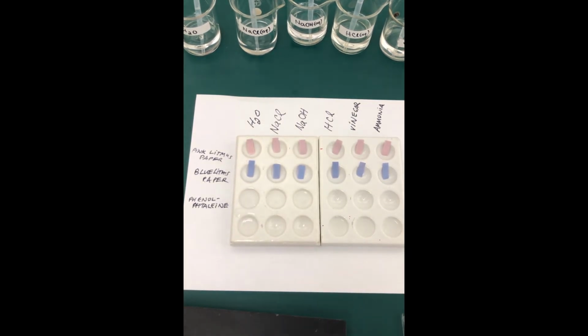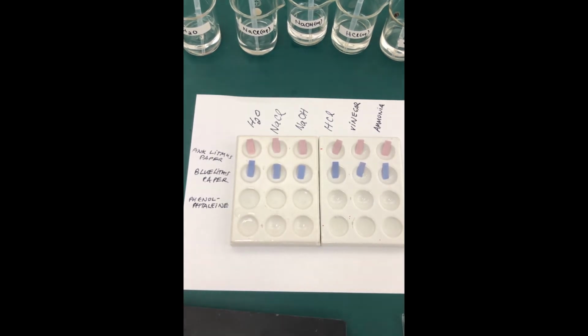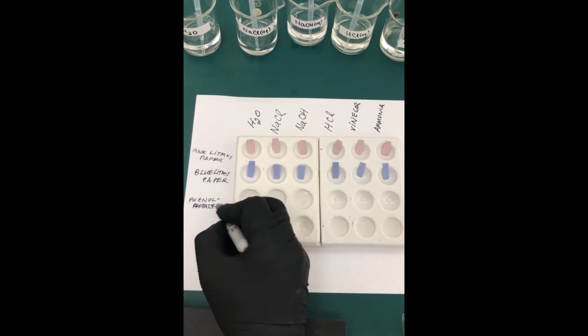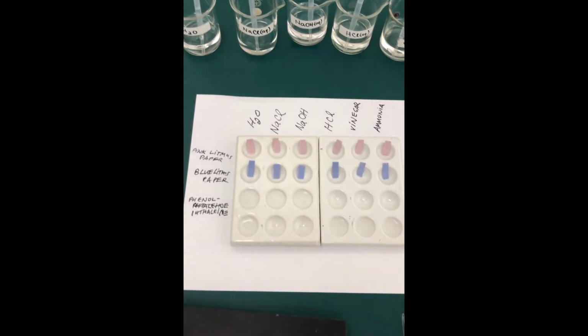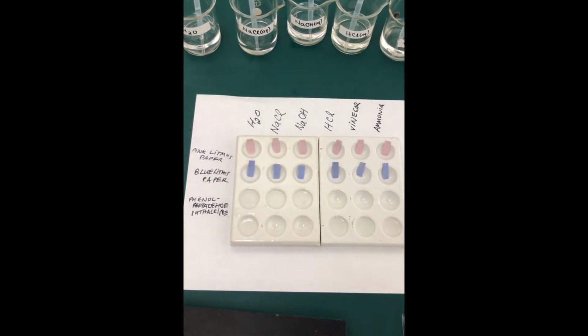And we're going to drop a little bit of phenolphthalein, which is misspelled in here. I'm sorry. This is phenolphthalein. It's hard to spell. I'm sorry about that. But here you go. More or less, phenolphthalein. It's as hard to pronounce as it is to spell. But anyway, we're going to test also that indicator chemical against our different samples here, okay?